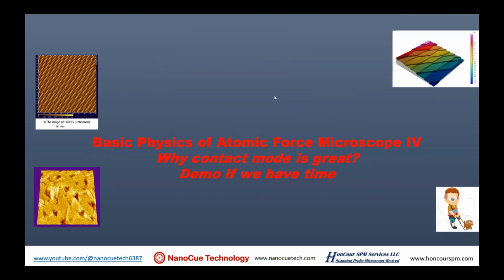Okay, and let's see, physics and AFM, atomic force microscope, number 4: why contact mode is great. There's a misconception, and I was just putting out a post on LinkedIn last night. I looked at the webinars provided by other great corporations. They advertise the latest, the greatest, how many channels, high bandwidth, 300 different imaging modes. And I asked myself, look at your best image. What imaging mode did you use? Actually the best image is not from a lot of very complicated modes. Sometimes it's just contact mode.